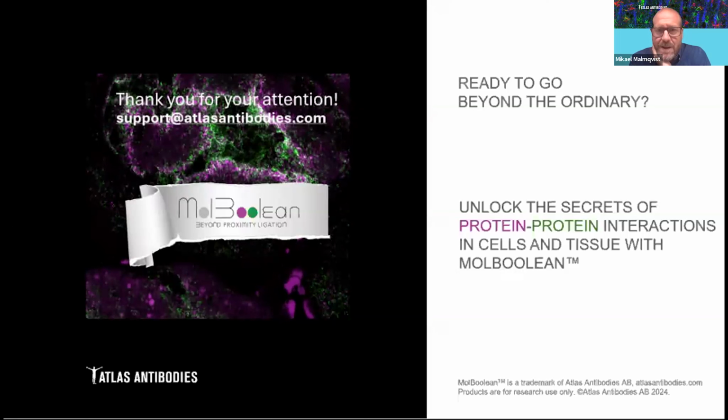Can the antibody affinity impact probe hybridization and the downstream quantification of free and interacting proteins? For example, if the two antibodies targeting protein A and B have different binding affinities, can this impact the quantification of the results? Yes. I think we always have to keep in mind that it's not absolute numbers of molecules that we see. It's based on how well the antibodies bind and all the enzymatic steps.